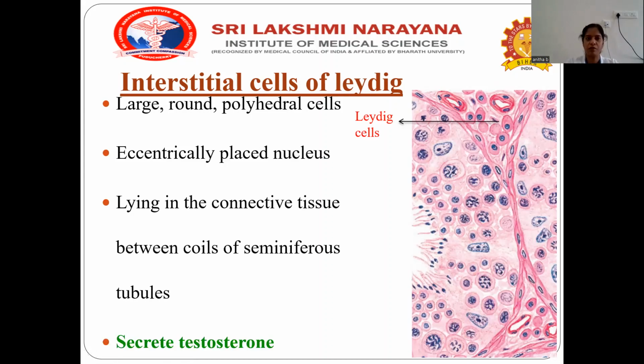What is the function of the interstitial cell? It secretes testosterone. Do you understand now? So what you have to know about the testis is the interstitial cells of Leydig and also the seminiferous tubule. Within the seminiferous tubule, you have to discuss the Sertoli cells and spermatogenic cells.